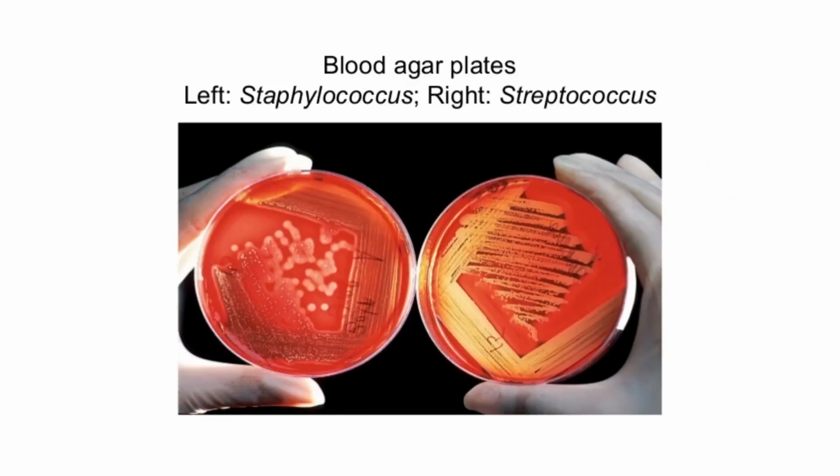Now that's all pretty cool, but why do we care about the identification of the bacteria in the first place? Why do I care when I look at these plates that I have Staphylococcus or Streptococcus? The most direct answer would be to determine if the bacteria that is present is of concern. In other words, is it pathogenic? And then, if it is dangerous, we could use the identification to determine the most appropriate treatment and which antibiotics would be most effective.